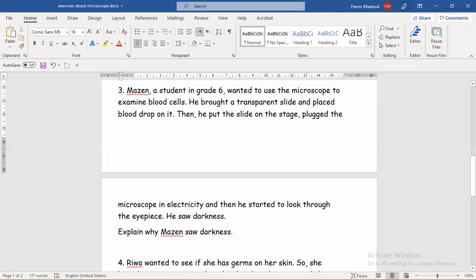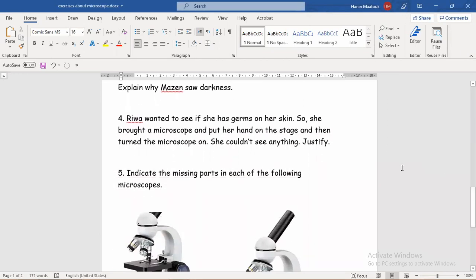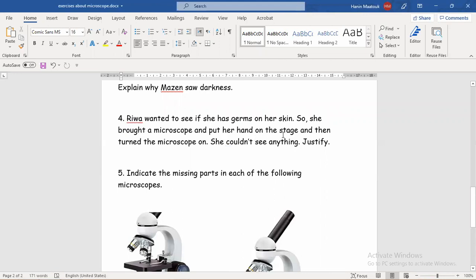Let's move to the fourth question. Rewa wanted to see if she has germs on her skin — whether her skin is clean or dirty and has germs or not. Germs are microorganisms, so tiny that we cannot see them with our eyes. So she brought a microscope and put her hand directly on the stage, then turned the microscope on. We have light on the microscope and it's turned on, and we have the object to be studied — the skin — but the surprise is she couldn't see anything.